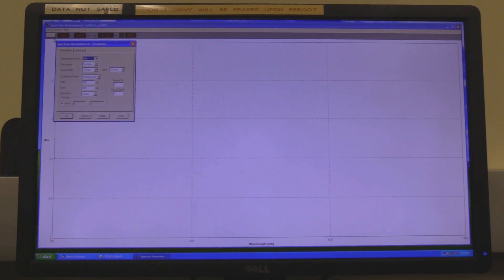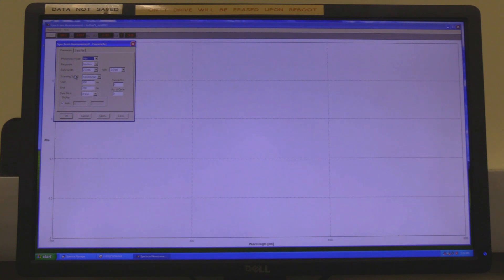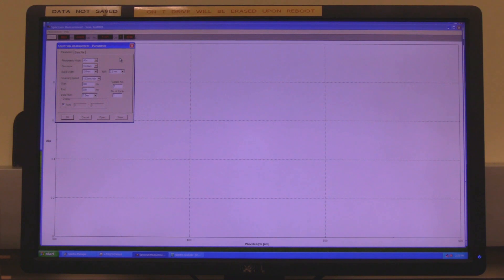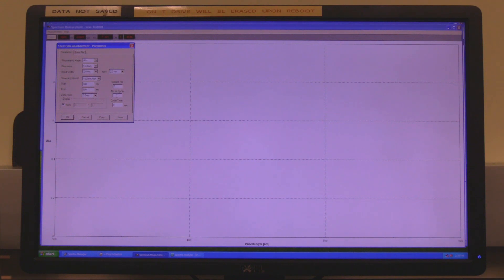The parameters window will open. Set the photometric mode, response, bandwidth, and scanning speed. Be aware, certain response and scanning speeds are not compatible with each other. Set start as the larger wavelength and end as the smaller wavelength. Data pitch is used to set the data collection interval. Number of cycles is used to set the number of measurements for a sample. If the number of cycles is 2 or greater, the cycle time input field will appear. Cycle time sets the time between measurements. If the cycle time is shorter than the measurement time, the next measurement starts immediately.